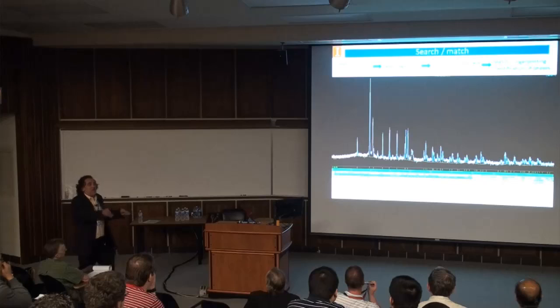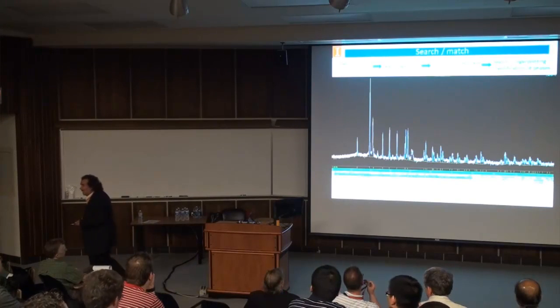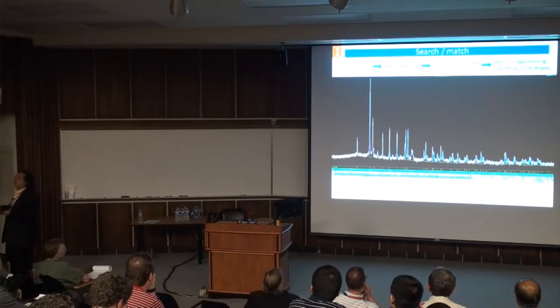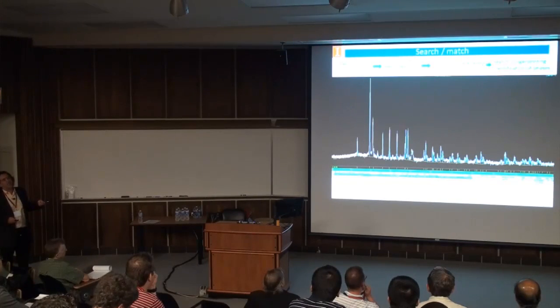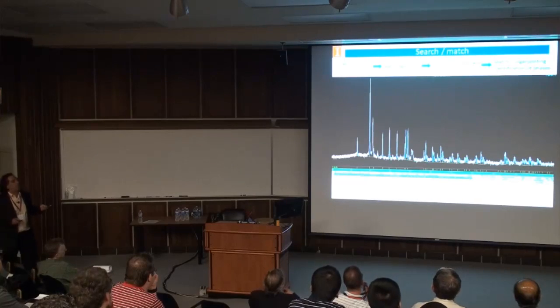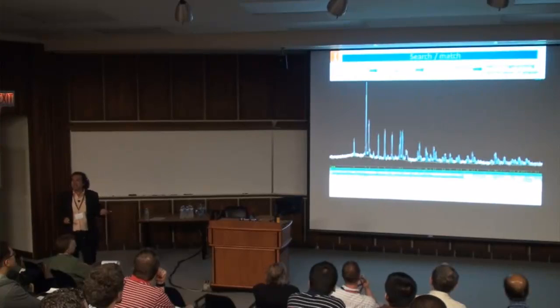I got the sample, I measured, I found where the peaks are. Now let's run these peaks against the database. There are many databases around, and the most famous one is the PDF4 database. What you are going to compare is peak position and relative height of the peaks against the database.